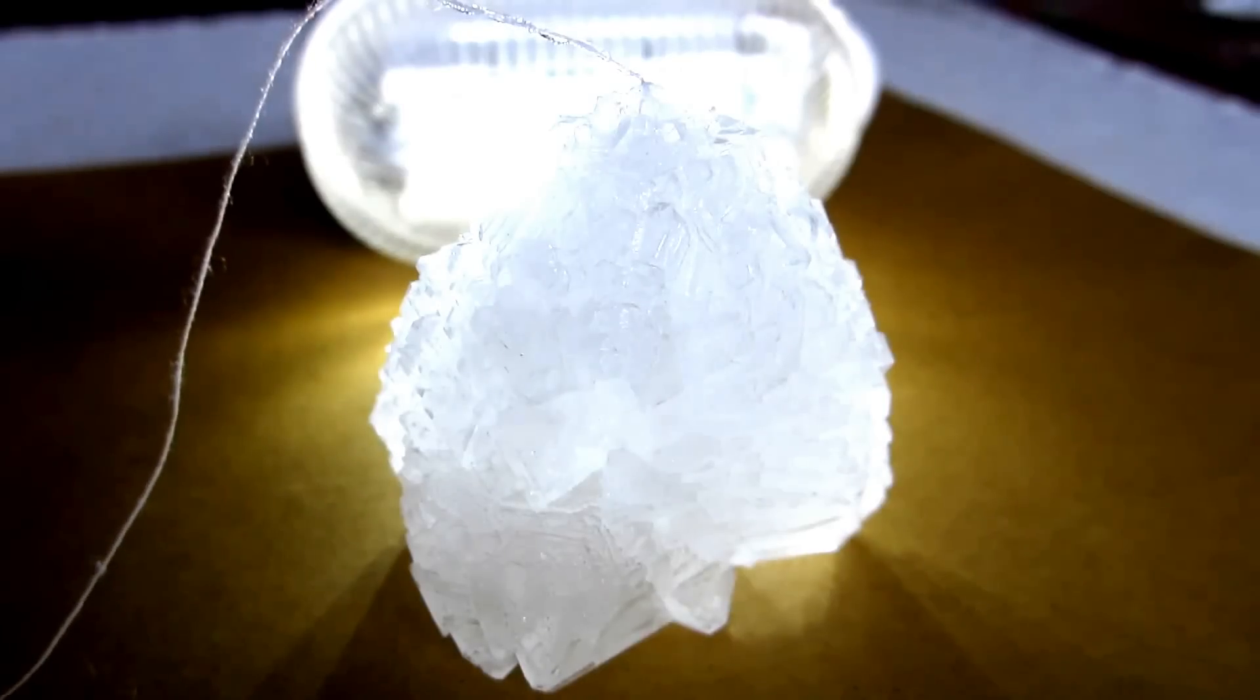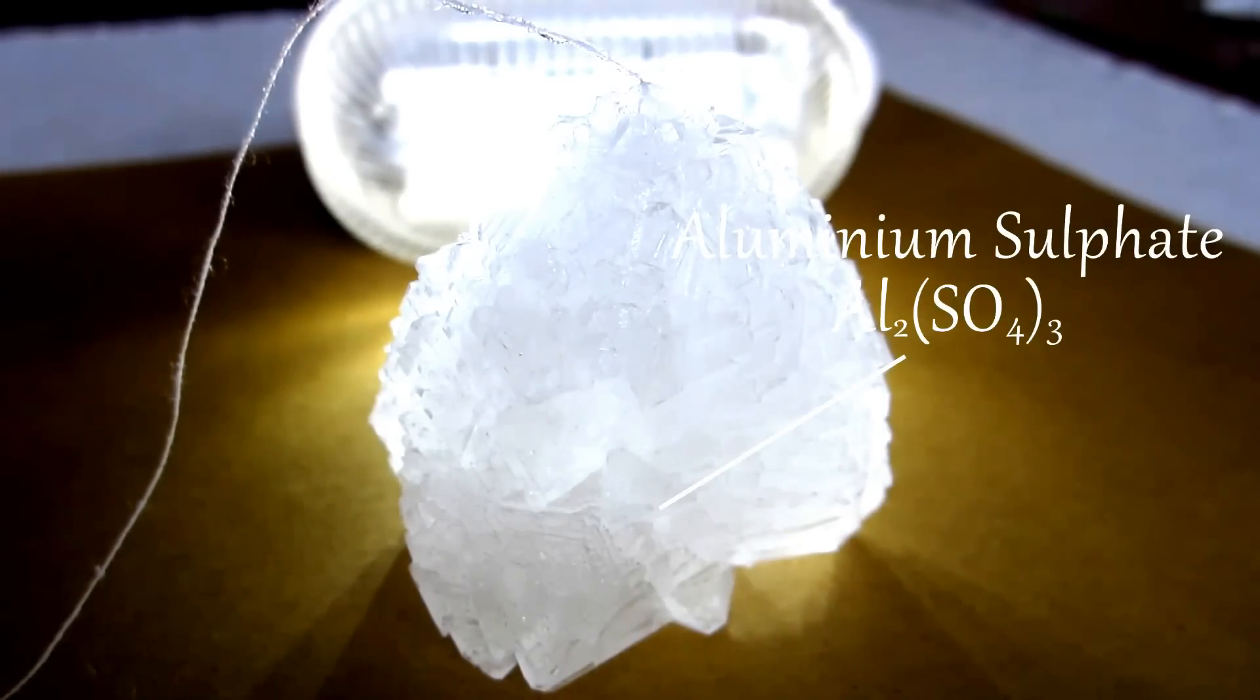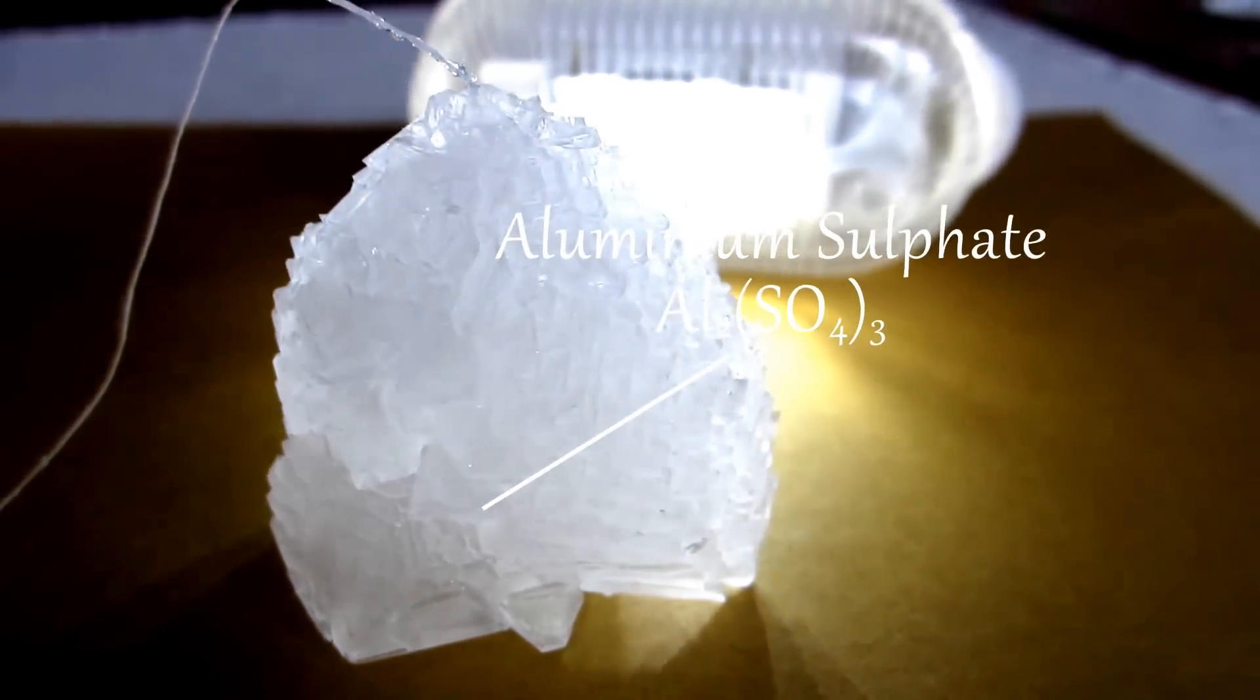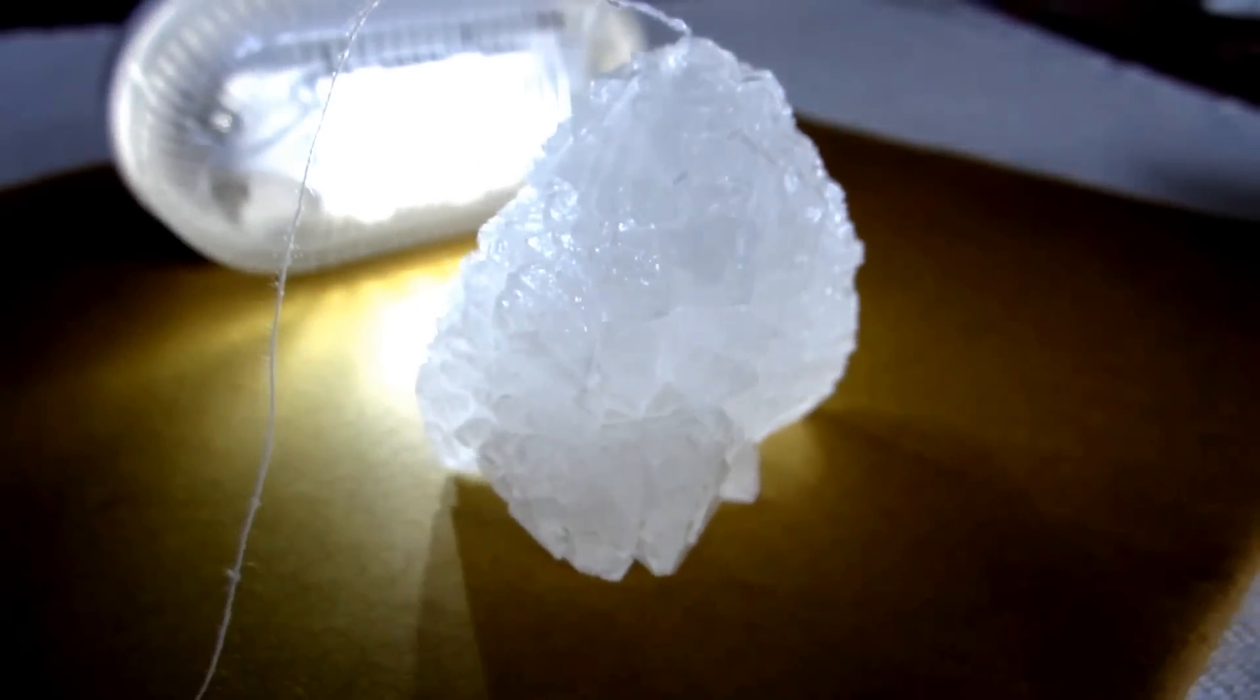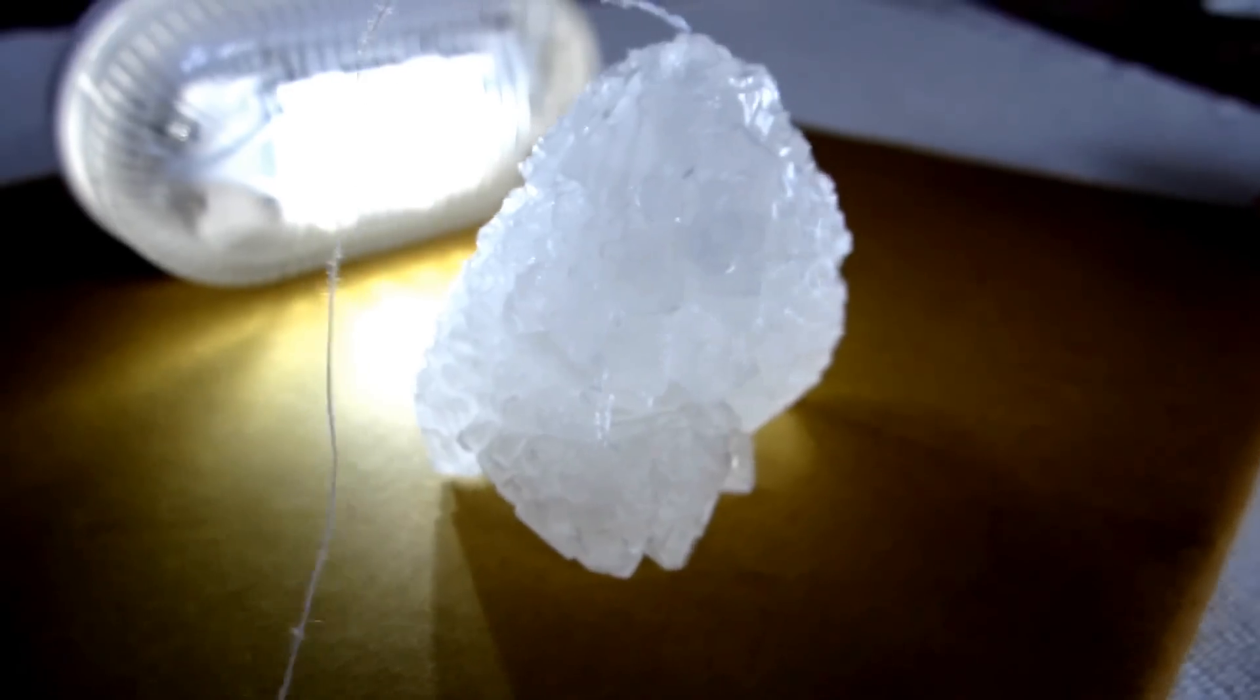There we have it, alum crystal which is aluminum sulfate. It is used in water purification which causes impurities to coagulate which are removed as the particulate settles to the bottom of the container or more easily filtered.